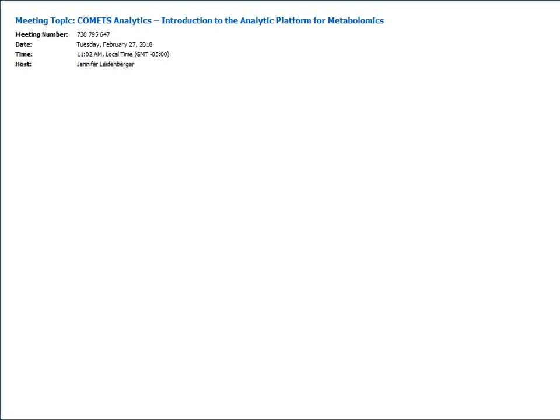Thank you. Could I add to this real quick? Please. It's mainly done at the metabolite level, but for the unidentified metabolites, depending on the platform, some of those may end up being metabolite peaks. Those can certainly be analyzed, because remember that the software will run no matter what the harmonization status is. So it's still possible to look at them, but of course in terms of the meta-analysis, they would probably be dropped out.